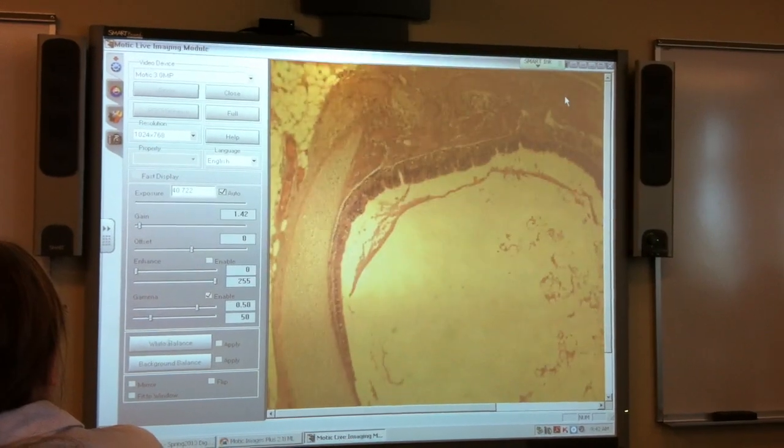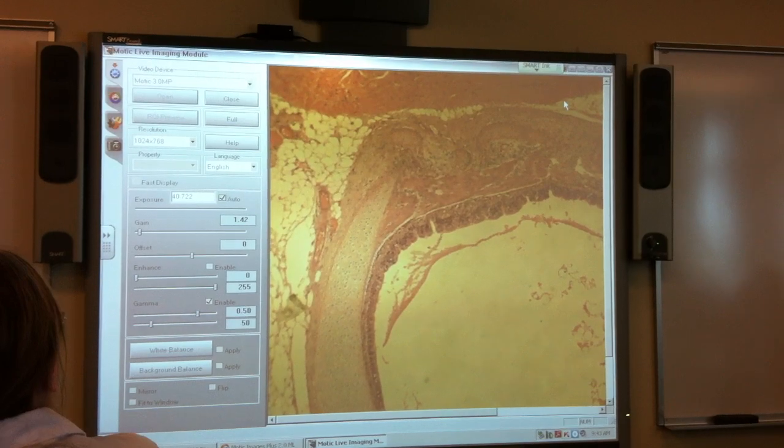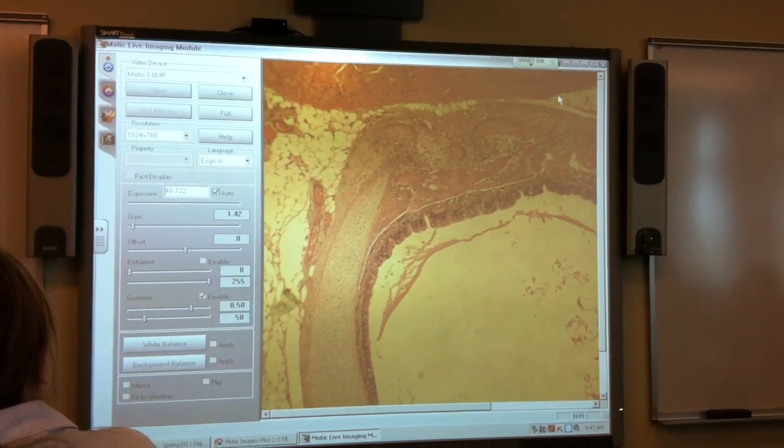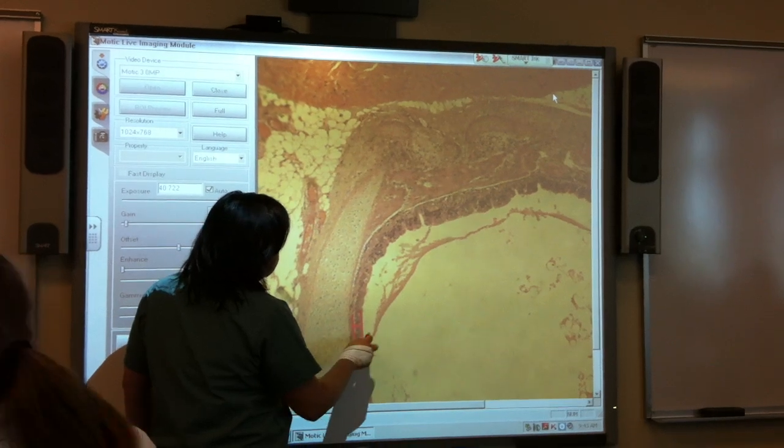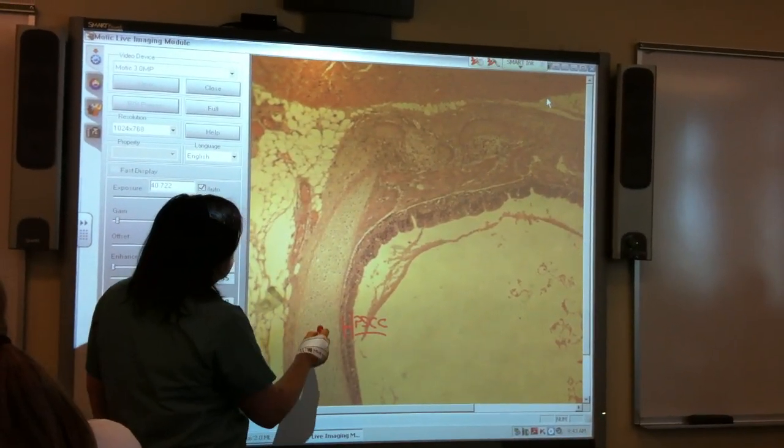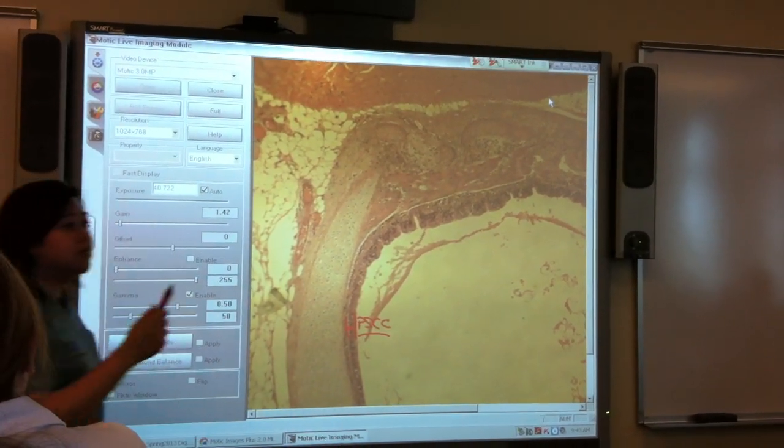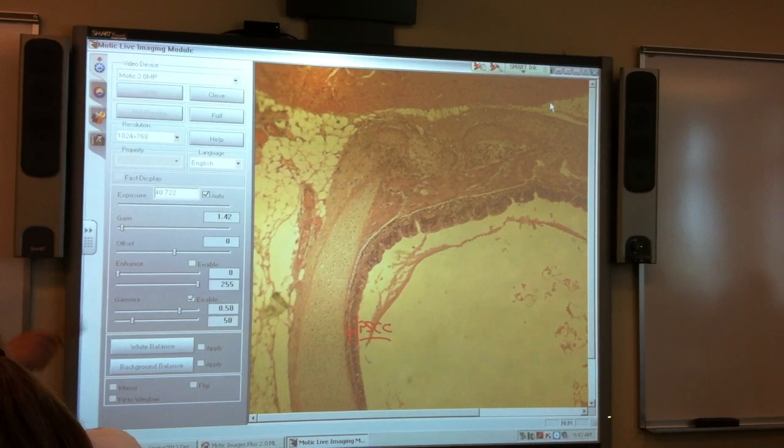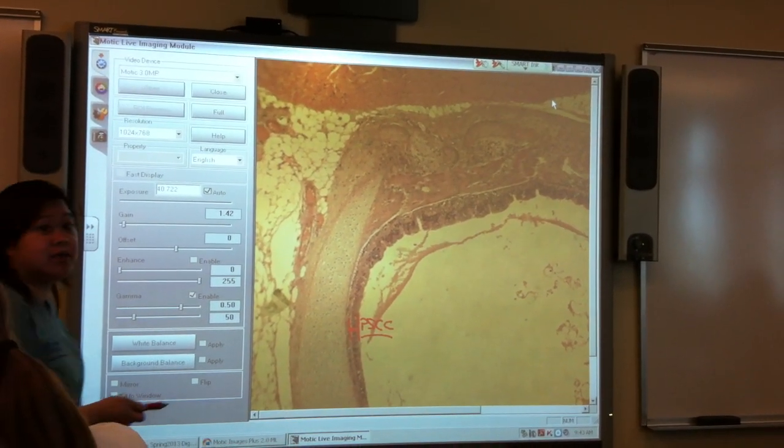And then this one. Trachea. Cell type. What do you call the cell type here? Pseudostratified. Pseudostratified ciliated columnar. That's respiratory epithelium. That is, but you have to call it, if it's asking for cell type. Yeah, no, I was just asking. Yeah, it's layer-wise, it's respiratory epithelium. Cell type is pseudostratified ciliated columnar cells.